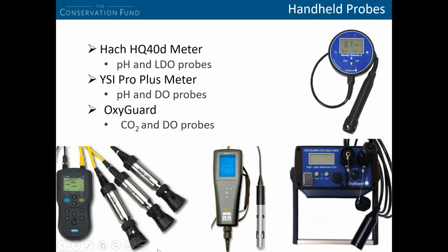So these are a few of the handheld probes that we use at Freshwater Institute. Now, of course, there are more types and brands of probes out there, but these are just the ones that we are the most familiar with. But regardless of the brand of probe that you're using, you always want to check the manufacturer's recommendations for calibration frequency, storage, and maintenance. If you don't take proper care of your probes, then your data will not be accurate, and also the probes will break more frequently or need high-cost repairs.